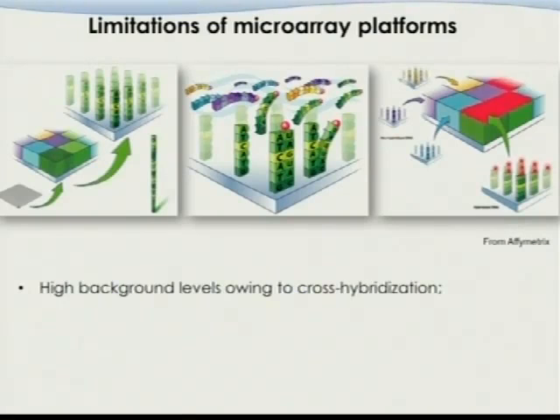And we have to be fair, okay? The first publication of microarray comes from, I believe, 1998. During the past 10 or 13 years, arrays have revolutionized a lot of functional genomic studies. There was no way that we could study gene expression on a genome-wide scale, and arrays are the first technology that enabled us to do that. And a lot of very high-impact papers were generated, and a lot of discoveries were made.